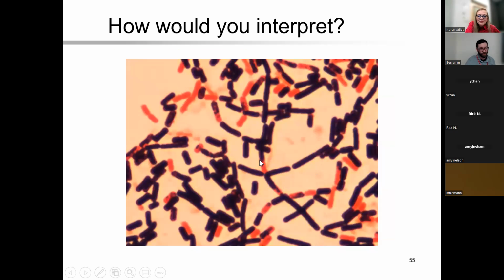Here are some of our big, we're saying boxcar-shaped gram-positive rods. These are large squares, rectangles. They're pretty noticeable. So this next one. Oh, and just to point out the decolorization part of it. Yeah, pretty obvious.